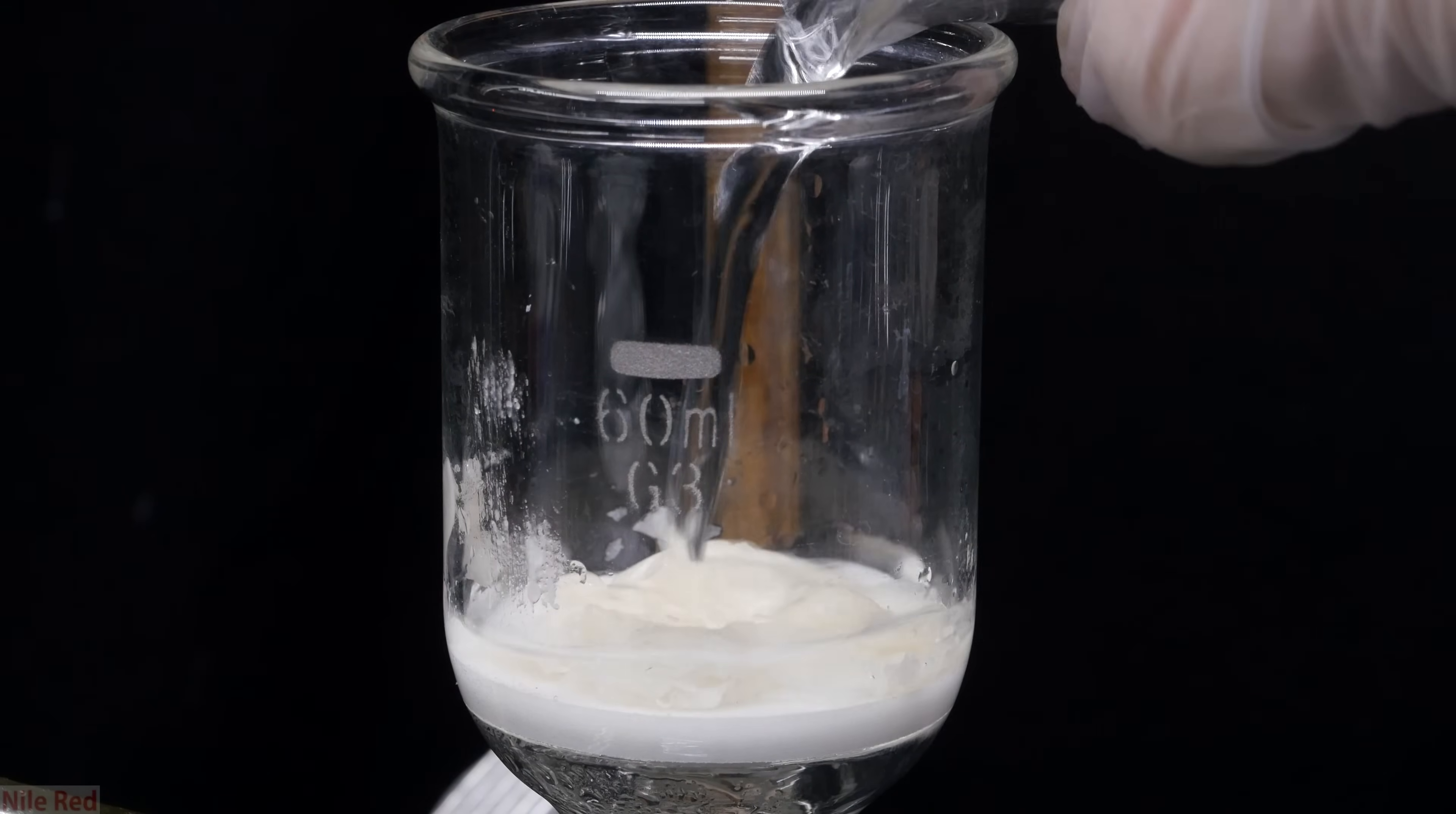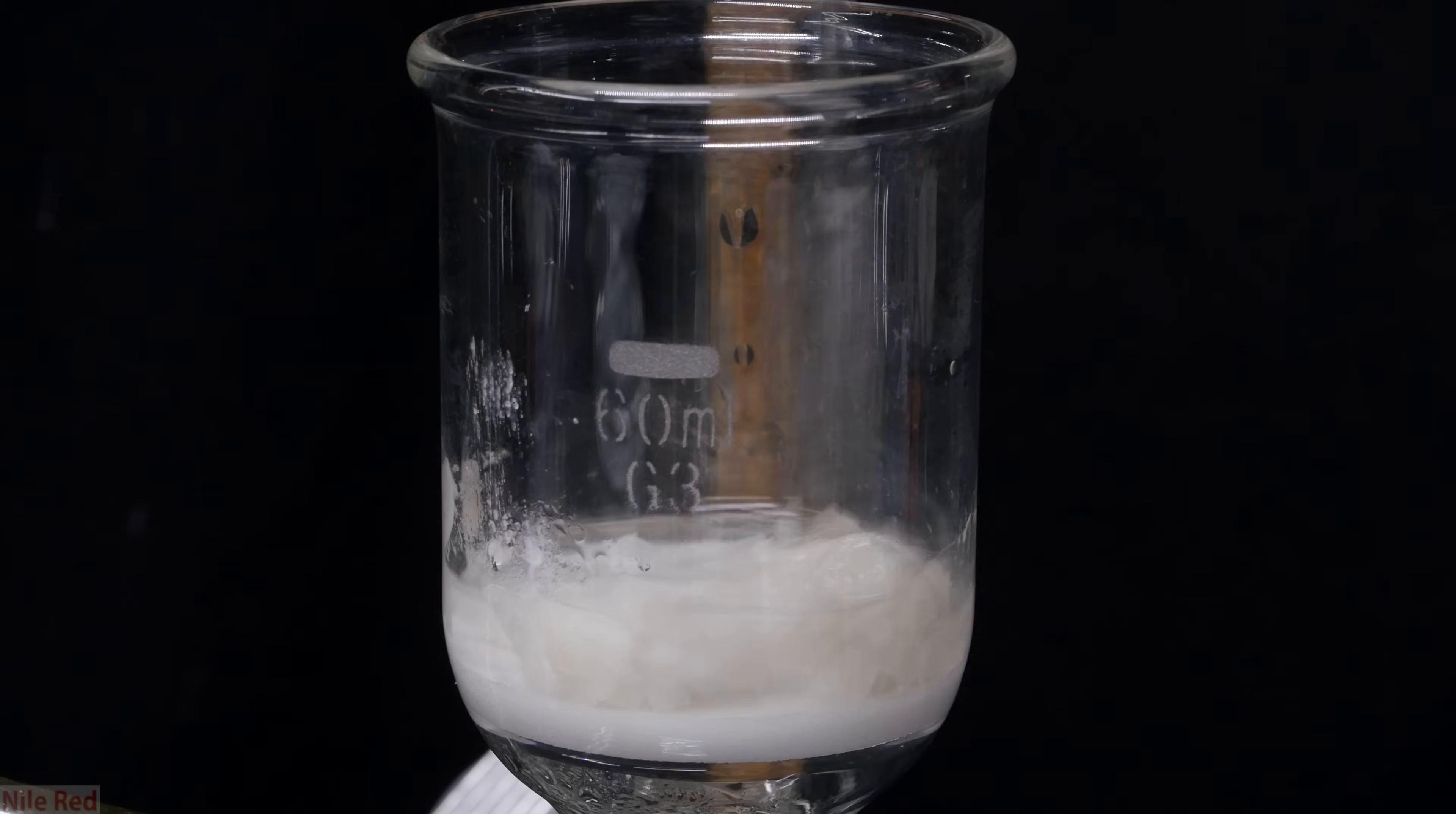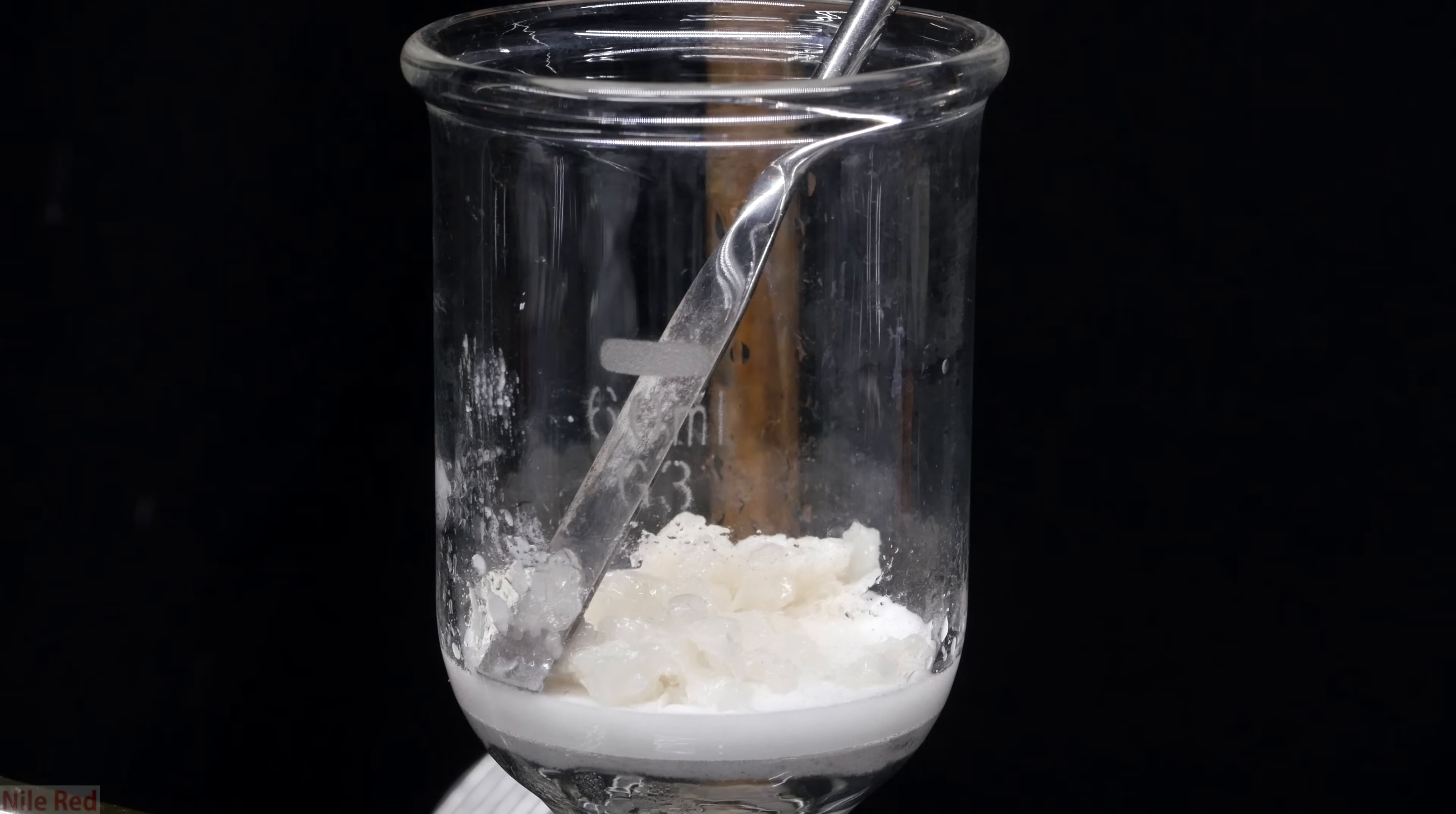Once all the water was removed, a little bit more water was added to wash it. I then use a spatula to mix it up a little bit and try to get it as clean as possible. The vacuum's turned on and the water's removed, and I leave it on for a bit to try to dry things up.